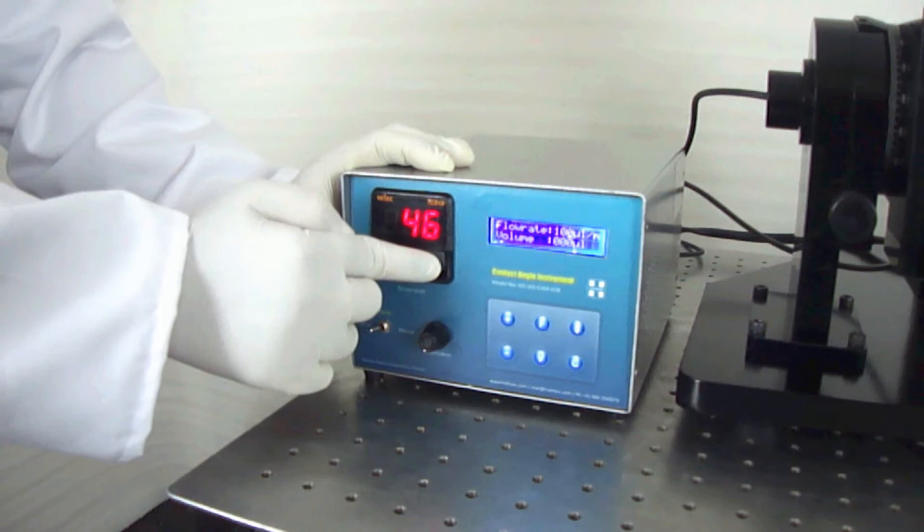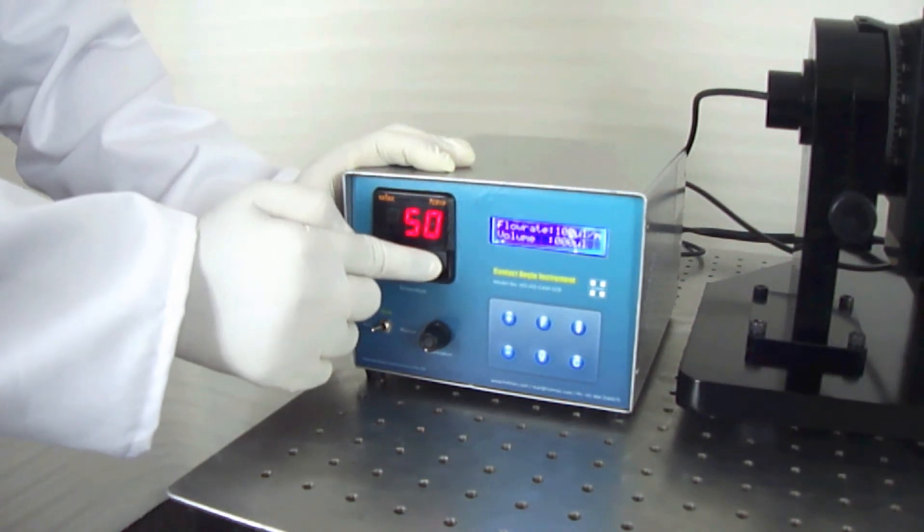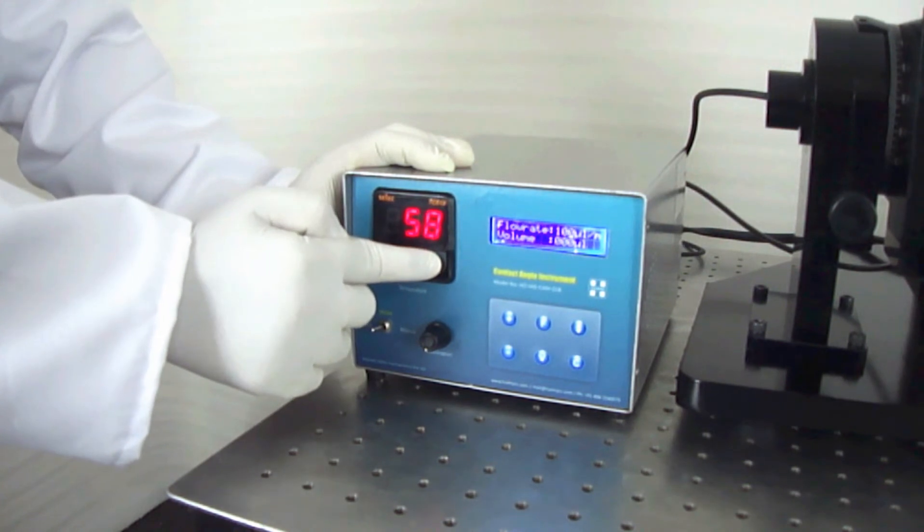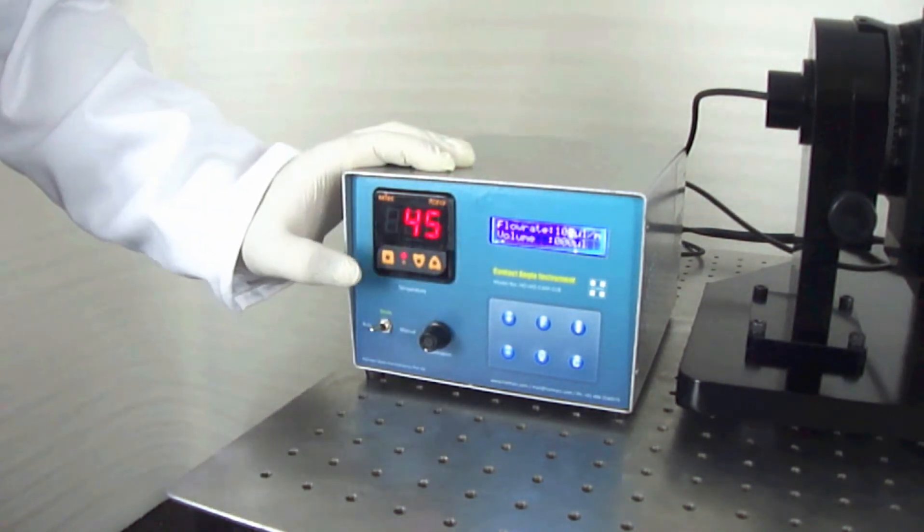The control box also has temperature control for the substrate bed where temperature up to 100 degrees Celsius from ambient can be set by the user.